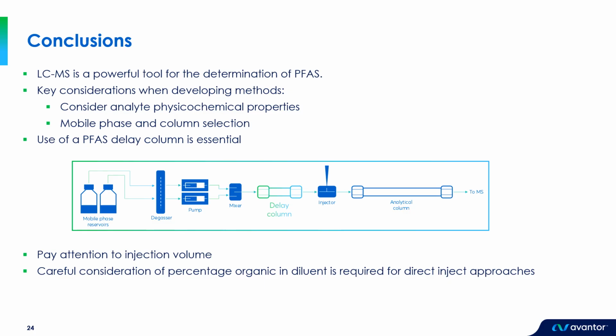We also need to pay careful attention to injection volume due to the use of high organic content diluents. And we also need to consider that diluent competition very carefully if we're looking to start moving towards direct injection approaches. And finally, we've run through a variety of applications that we've worked through in our lab that help demonstrate some of these points.